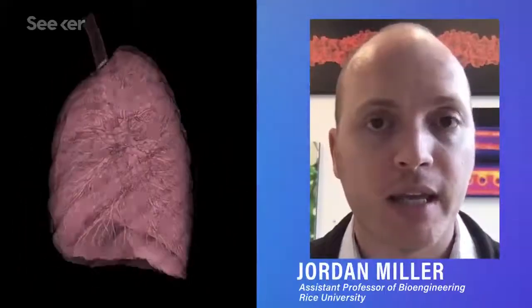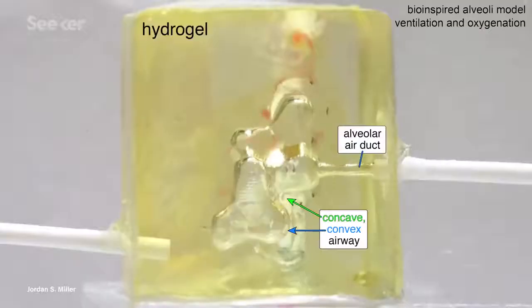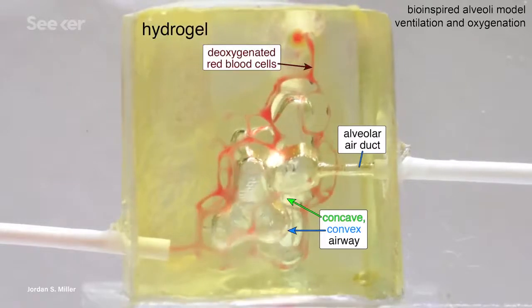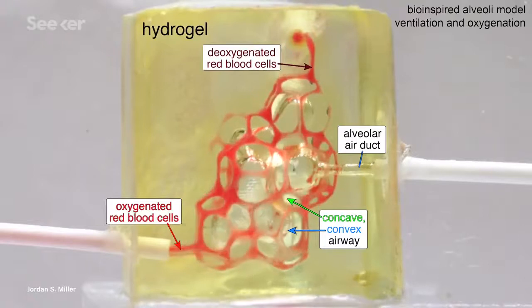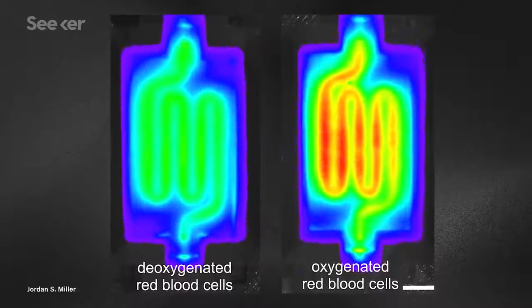The team behind this model is trying to replicate the complicated architectural structures of our organs using 3D bioprinting and use the lung as their proof of concept. It is a very complicated structure, yet it has extremely clear readouts for its function. If we have a mimic of lung tissue, we can pump in deoxygenated red blood cells, we can ventilate in the airway oxygen, and we can see to what extent those red blood cells will take up the oxygen that we've been putting into the air sac.